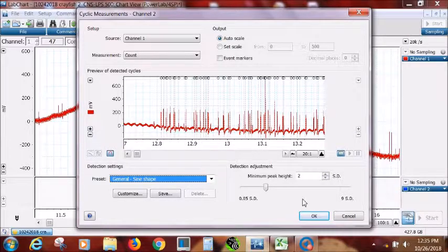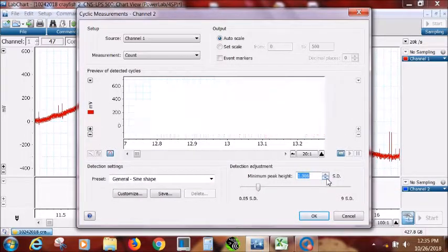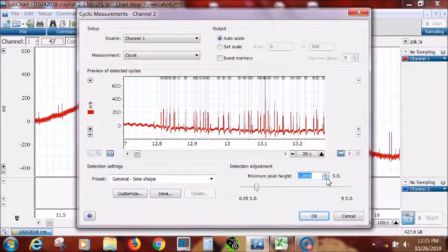So what can we do? We can take the standard deviation here and we can lower it. So now, if we keep lowering this, we will see in time, oh, it grabbed that one now. That one is counting. And it grabbed this one, it's counting that one. Let's go a little lower. And if we go here, now we're counting this one. So now we're pretty convinced it's not counting little noise values, but it's really counting the spikes.